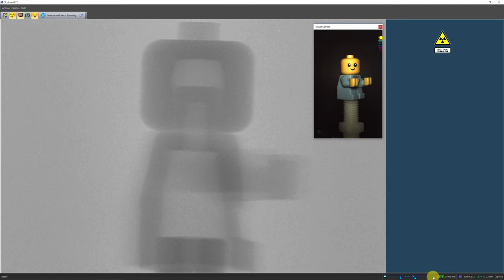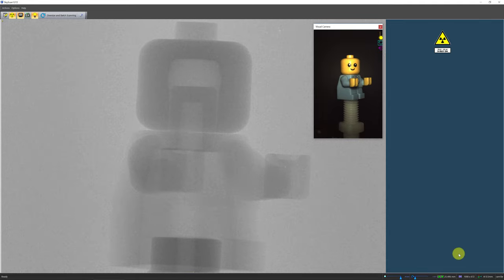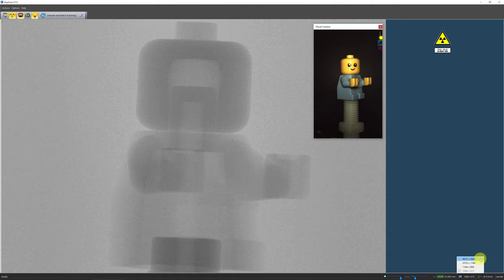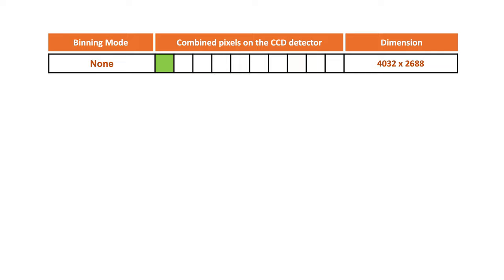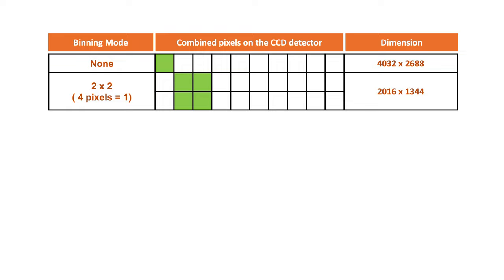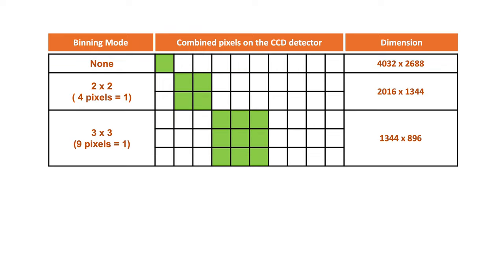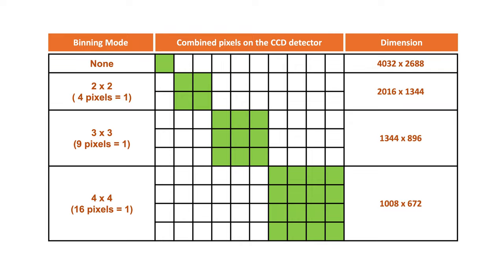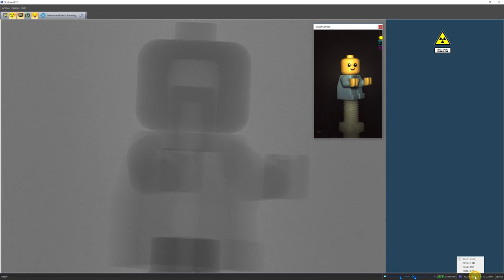After setting the pixel size by changing the zoom, next we will set the detector's camera binning mode. The Skyscan 1272 is equipped with an 11MP CCD camera coupled with a scintillator for x-ray detection. The highest pixel density detectable without camera offset is 4032x2688 pixels. With camera binning, the pixel size will change — the higher the binning, the lower the resolution. However, camera binning can reduce scanning time and increase the signal-to-noise ratio. To begin your experiment, we recommend binning the camera at 2, which gives a balance of decent resolution, manageable scanning time, and data size.